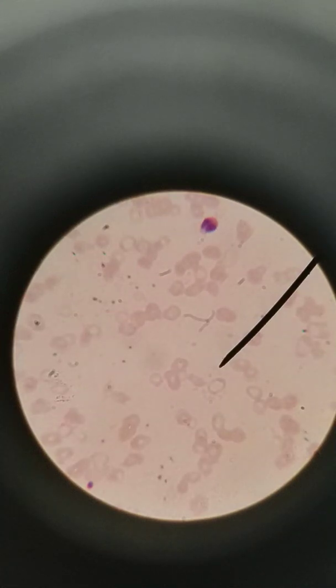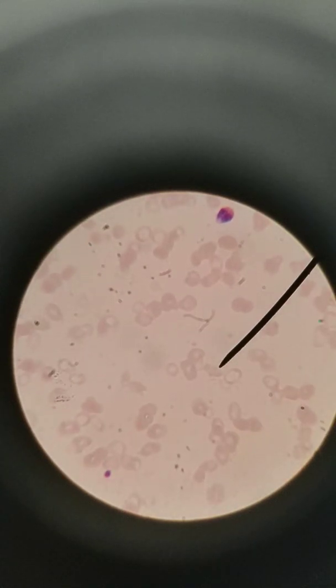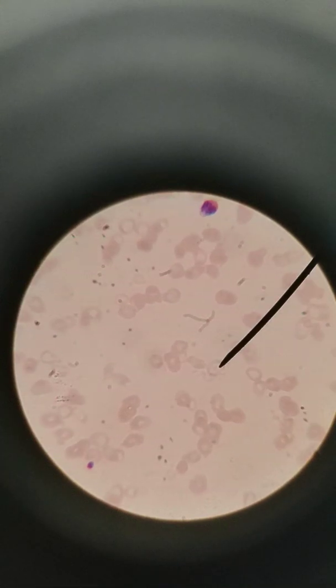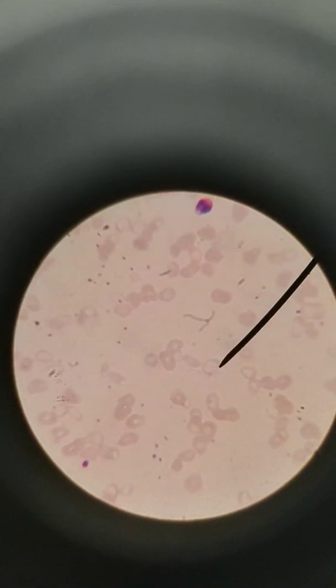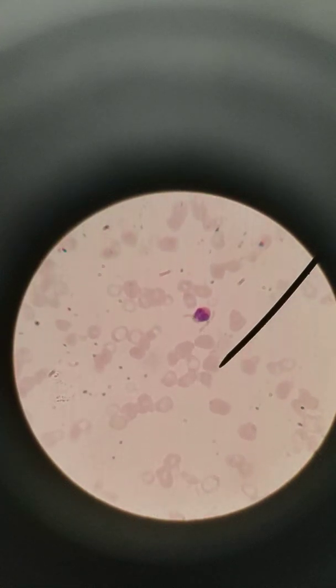What you'll notice is that the cells are a bit misshapen too, but let's look at a cell that's on its own. We're at 1000x. We can see a cell here, like this one right here. It is lighter in the middle. It is darker on the outside. Hopefully you can tell that it's bigger than normal. It tends to be more oblong. It tends to be more oval shaped.